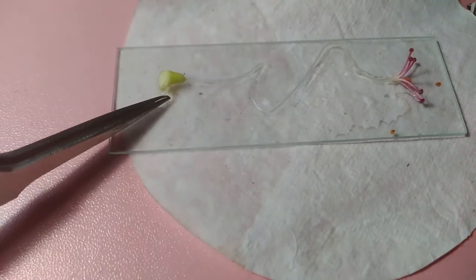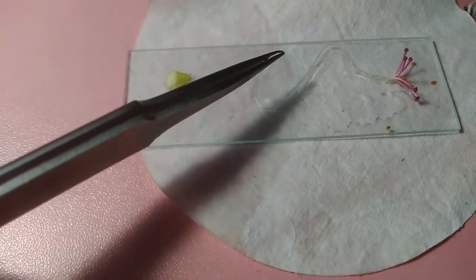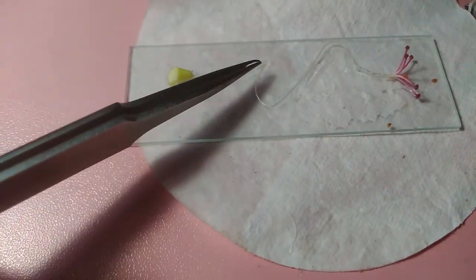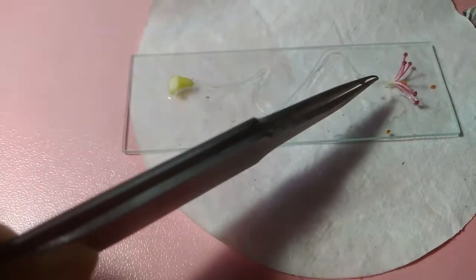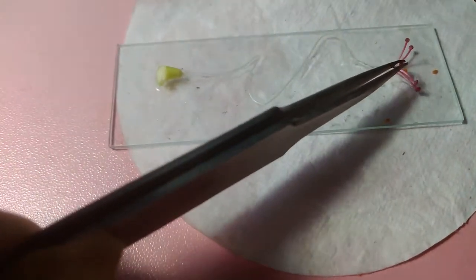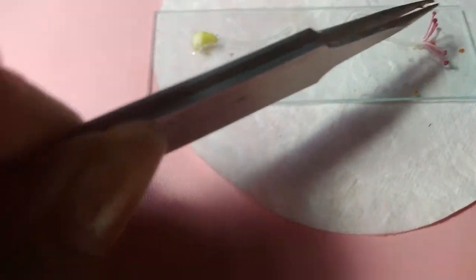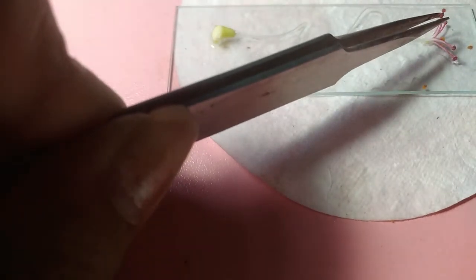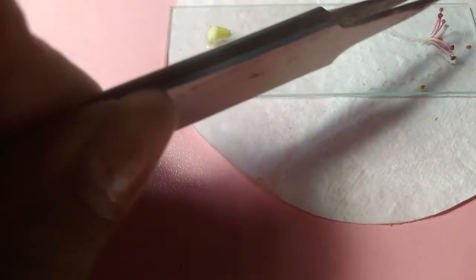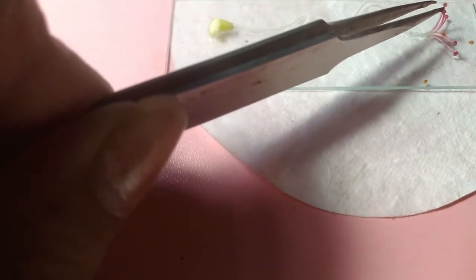At the bottom we have our ovary, and this ovary is then connected to the style. This thin fine filament like structure, this is the style. And above at the top, the style is branched to form 5 structures, and these 5 structures are connected to the stigmas. These dots at the top, these are the stigma. This is the place from where the flower receives the pollen grain. Okay.